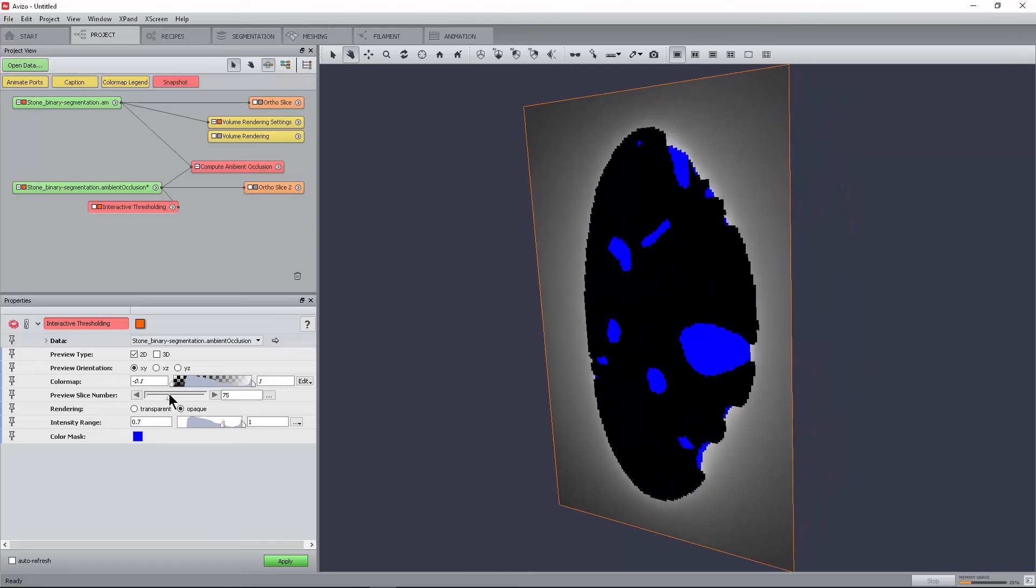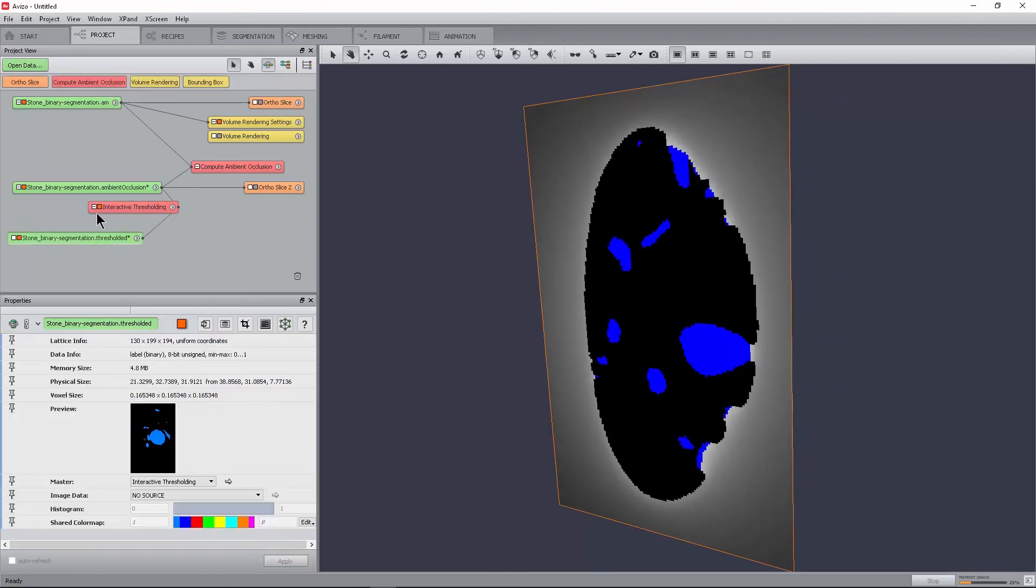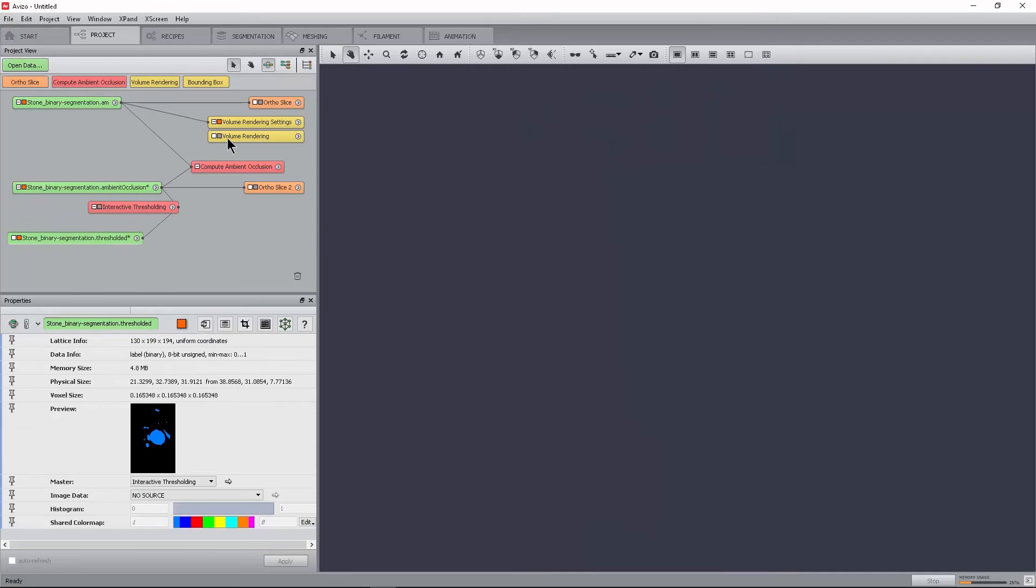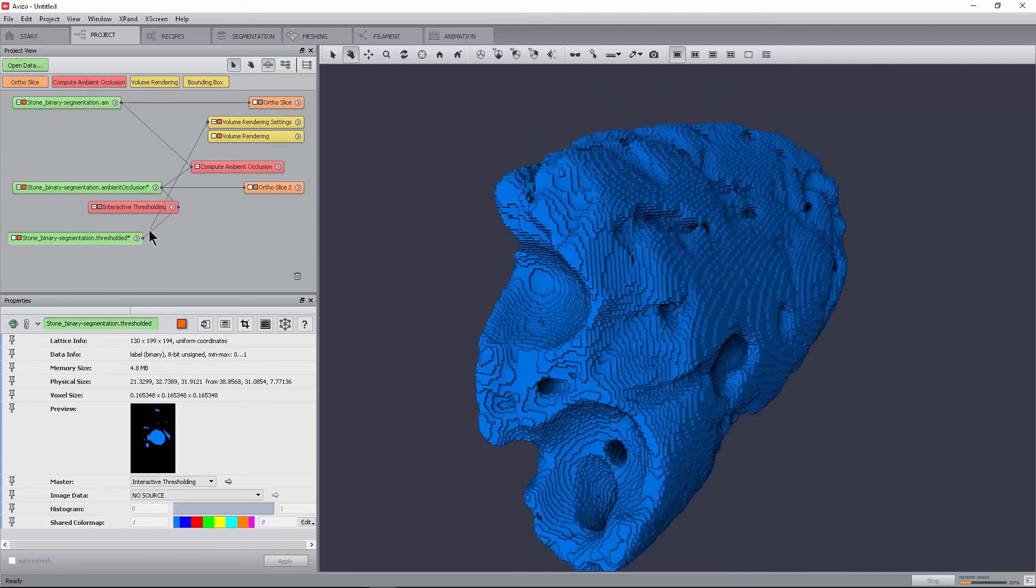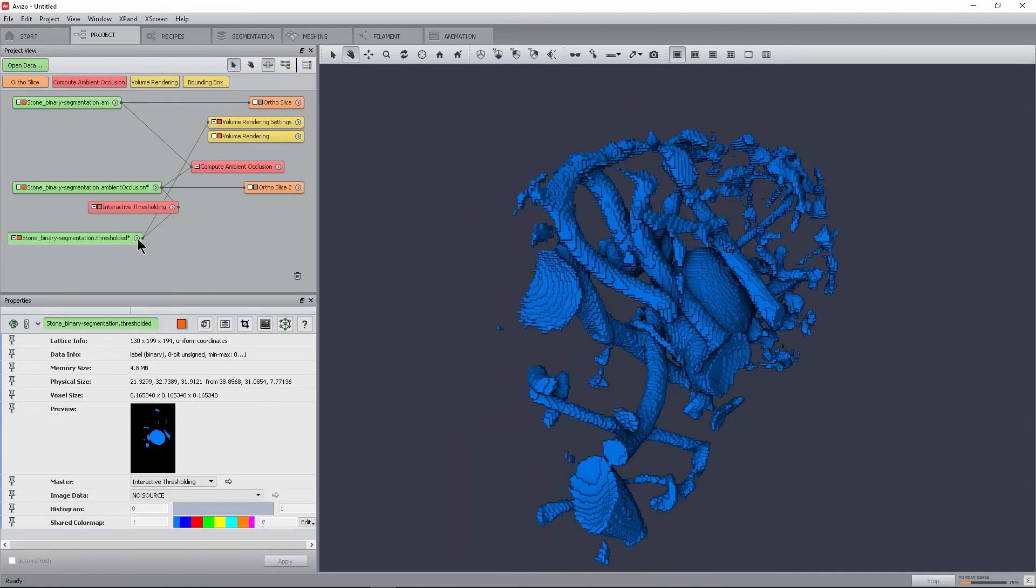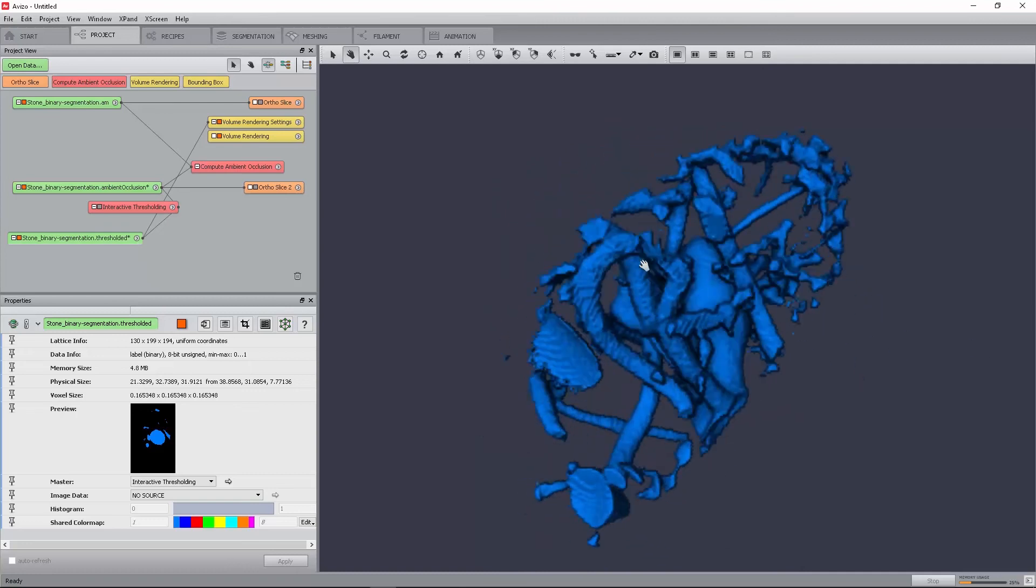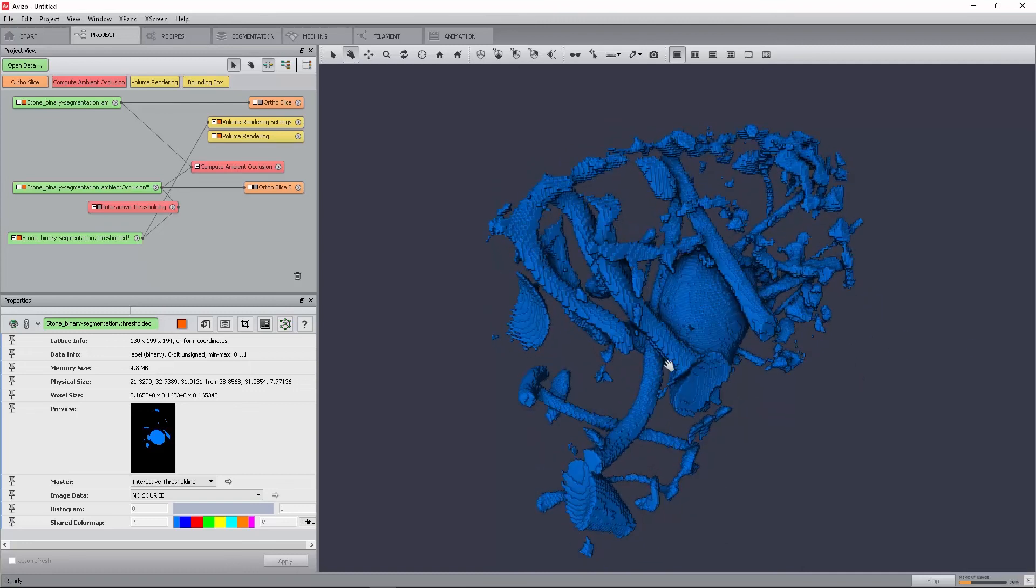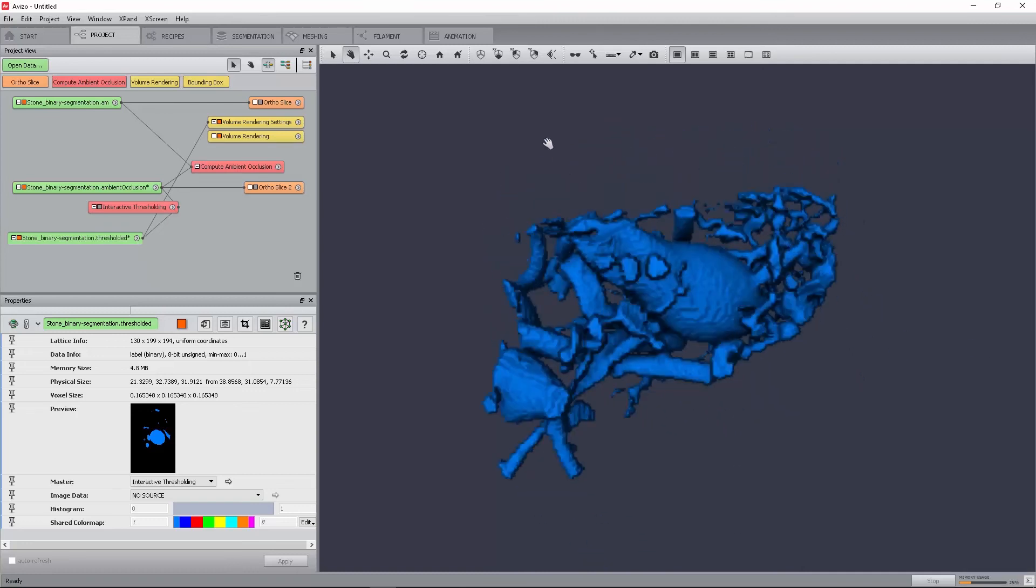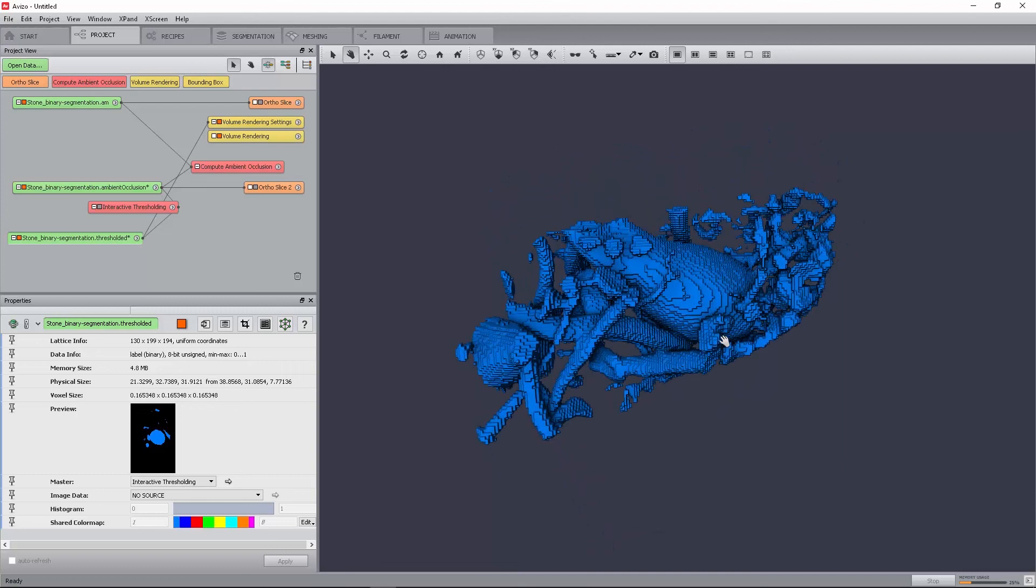This generates a binary segmentation of the cavity structure that can be visualized, for example, using the voxelized rendering module. In most cases, the result of this segmentation will still contain some noise. That is, small labels that are not connected.